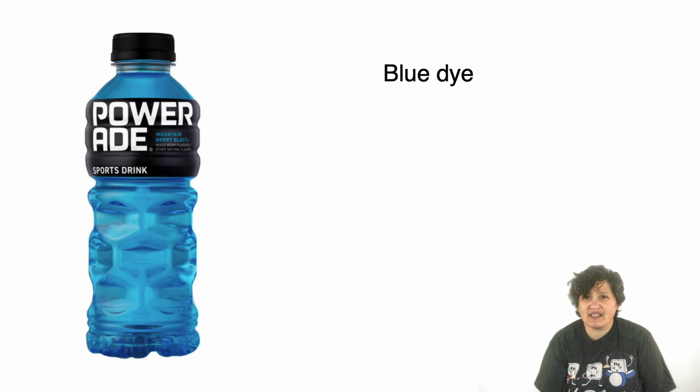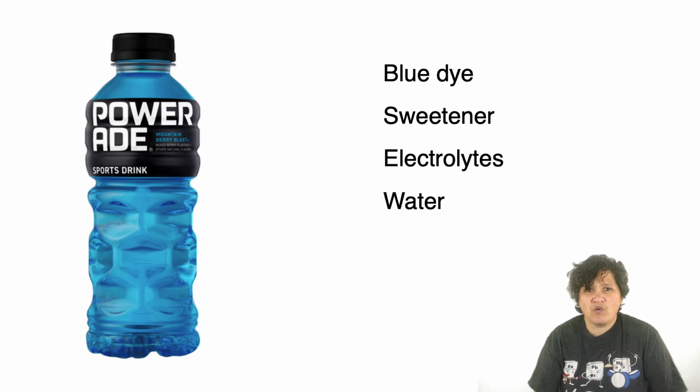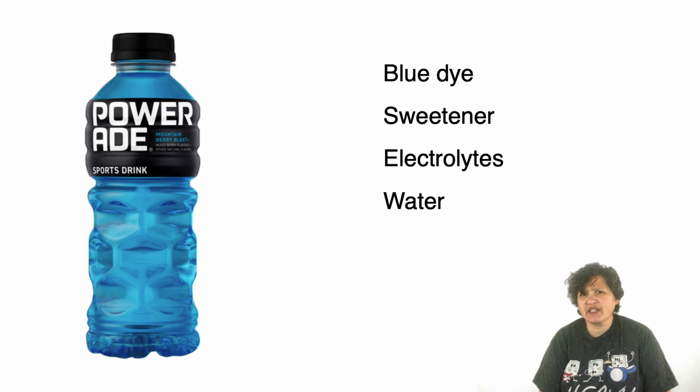But that's really only useful for very specific situations. Often, as I mentioned, you'll be looking at a mixture containing a lot of things, not just the compound you're interested in, a substance we will refer to as our analyte. There may be compounds in that solution other than your analyte that absorb at the wavelength you're measuring at. For example, you might be analyzing how much blue food dye is in your sports drink, but there's not just blue dye in there. There's also sugar, electrolytes, and of course, water. So how can we accurately quantify just the concentration of an analyte?